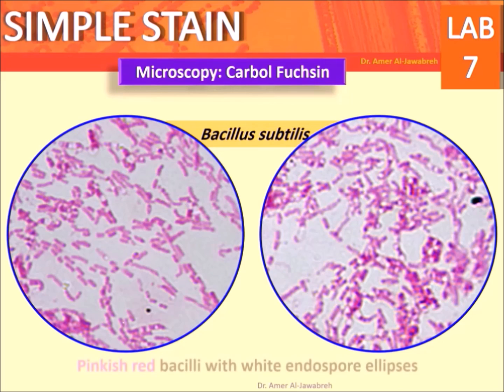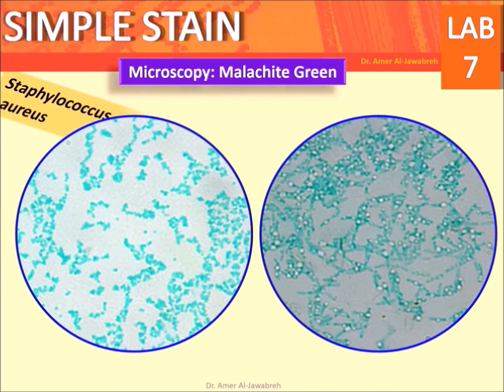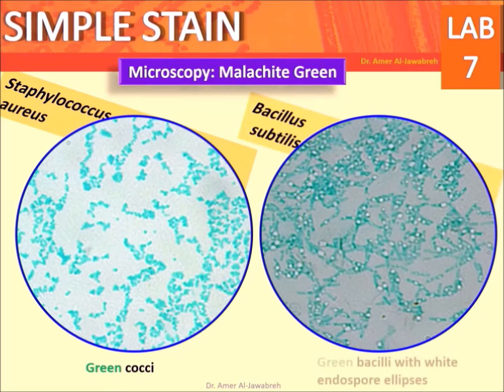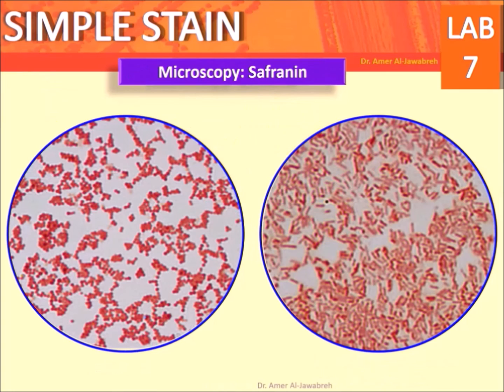Microscopy results — carbol fuchsin: Bacillus subtilis appears as pinkish-red bacilli with white endospore ellipses. Malachite green: Staphylococcus aureus appears as green cocci. Bacillus subtilis appears as green bacilli with white endospore ellipses.